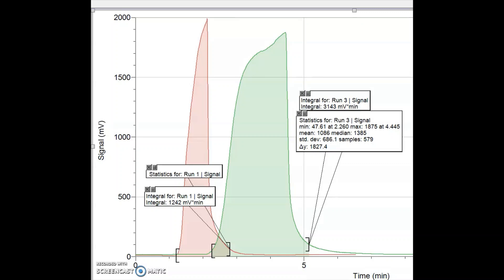Here in green, I've done a similar analysis for the n-butanol peak. Even though we used the same number of microliters — the exact same amount of n-butanol as we did in the first run with n-propanol — you can see that the n-butanol makes a much broader, larger peak with the same volume of sample. Having done the statistics on this, I can find that the maximum point of this peak is about 4.445 minutes. You can see the area under the curve is significantly larger.